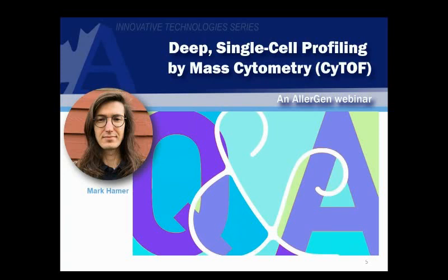You have these clusters represented in either tSNE or, in the case of RNA-seq data, PCA space. Those axes don't mean anything other than giving you a frame of reference, basically a 2-dimensional best fit view of the highly dimensional data. Very good.